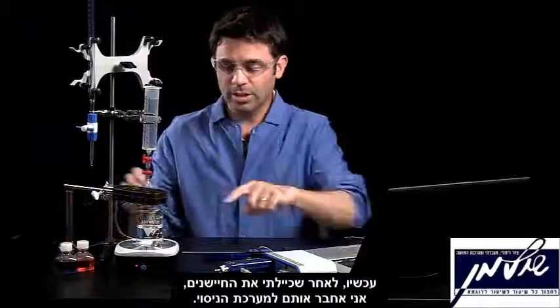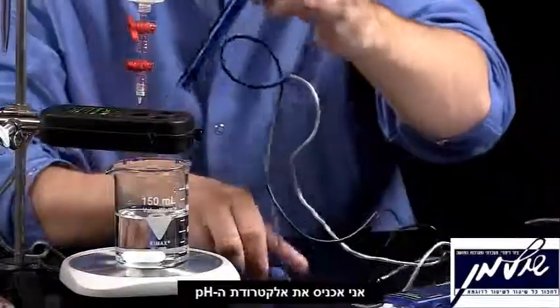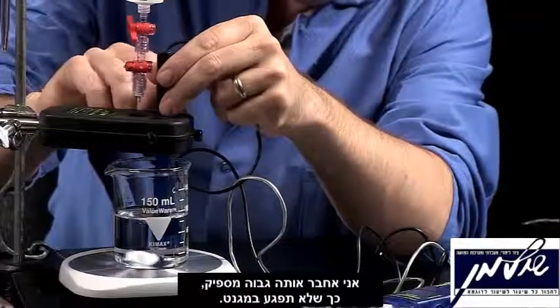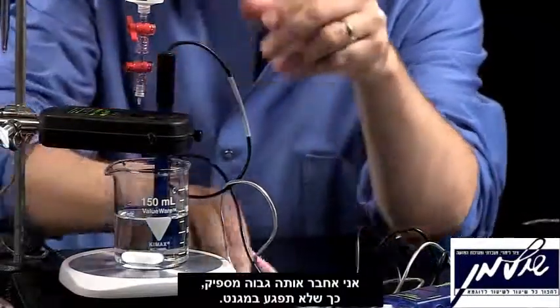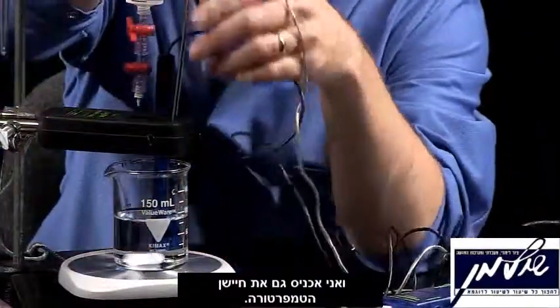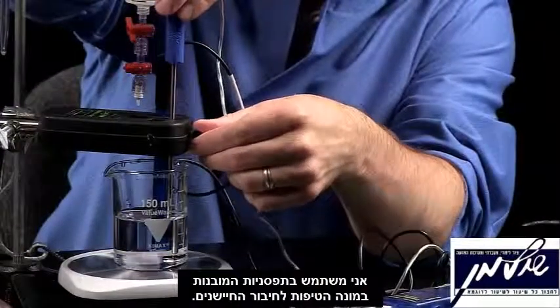Now my measurements are set up and I need to set up my probes. I'm going to put in my pH sensor — far enough so that it doesn't hit the stir bar. I'm also going to put in my temperature sensor, taking advantage of the drop counter's multiple sensor ports.